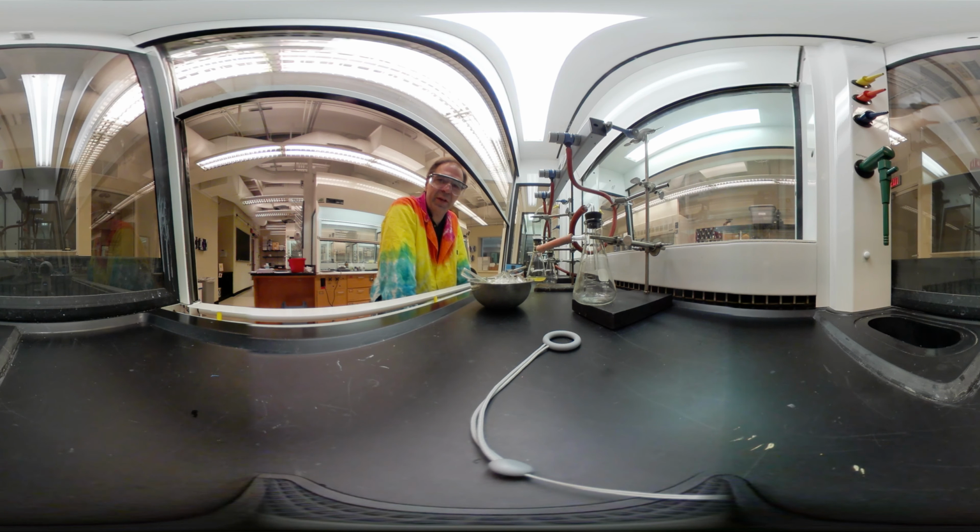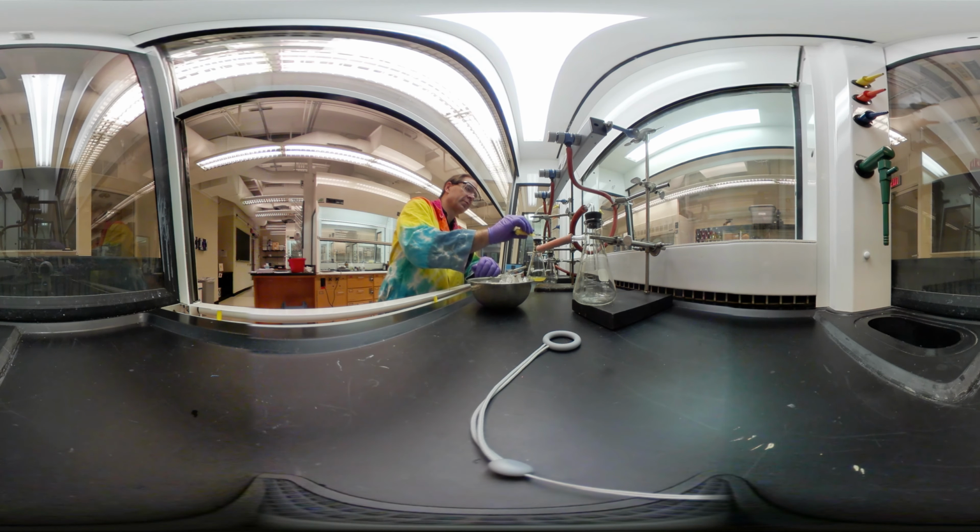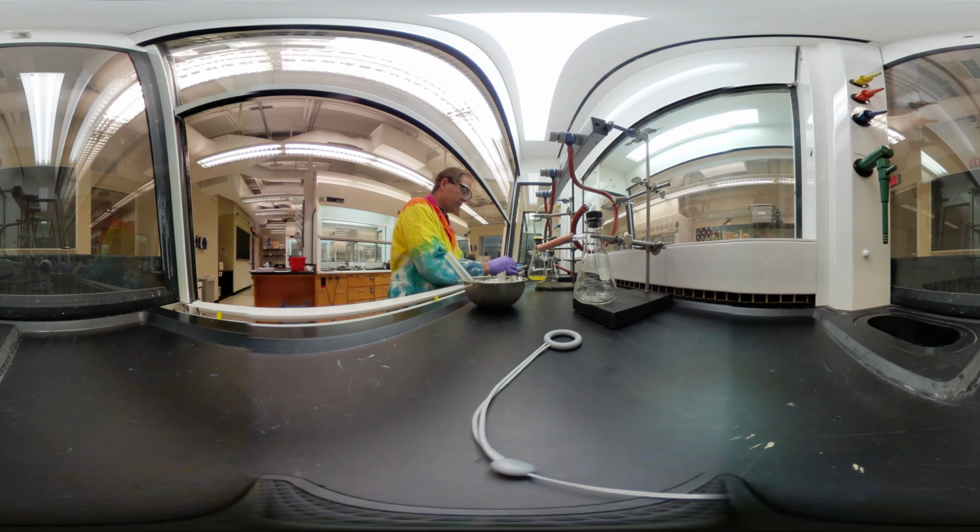Today we're going to do 2 characterization tests. One is IR, as I said, and the other is we're going to test it by reactivity, and this is something that we haven't done as much this semester, but is one that's commonly used. If I made the right compound, then it should behave in a particular way. That can be a spectroscopic behavior, or it could be a chemical behavior. And so we're going to try that. We're going to see if it behaves the way we want it to. I'm going to split my product, and I'm just going to be filtering it at 2 times in 2 different filters so that we can go a little faster.